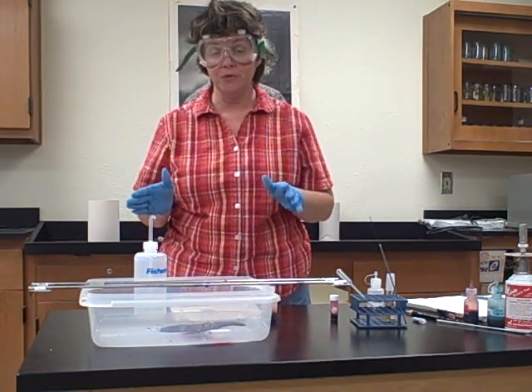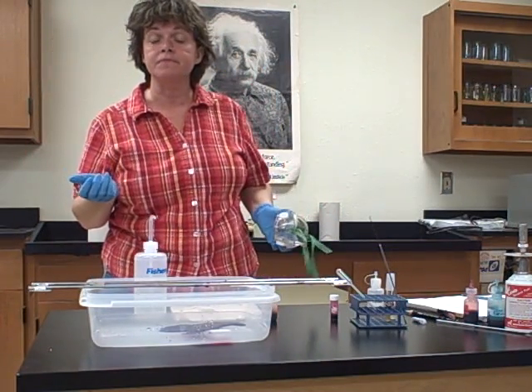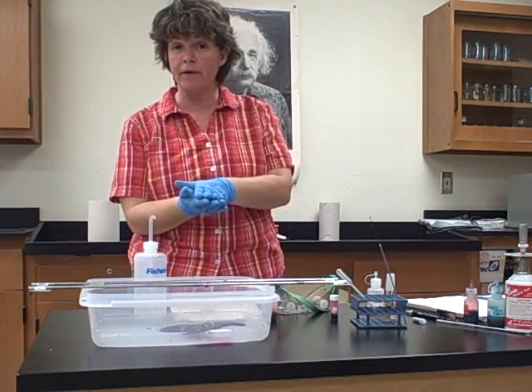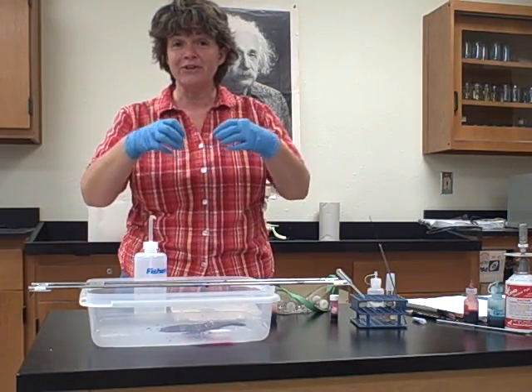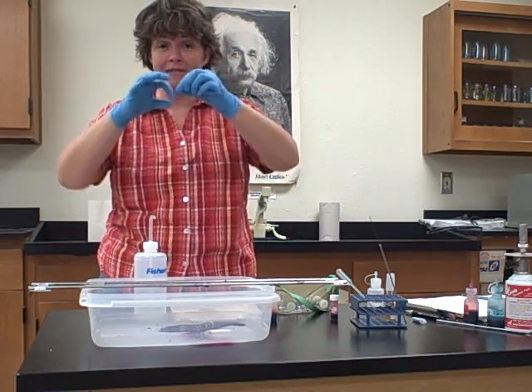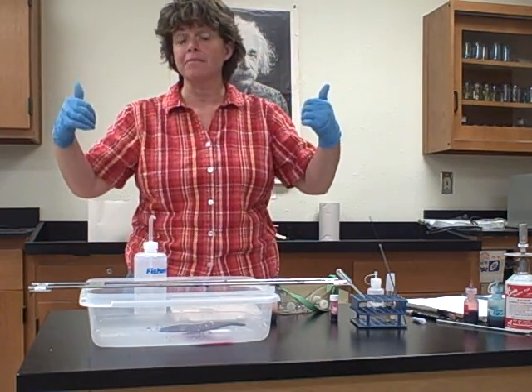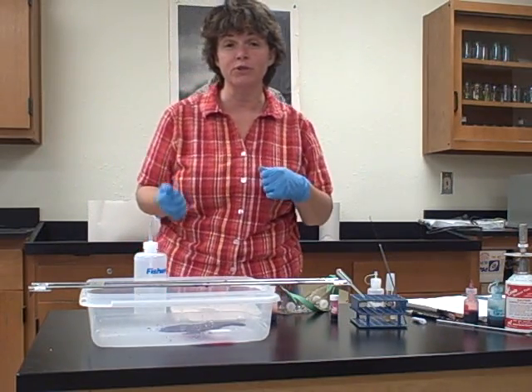Okay. One of the cool things about this particular stain is that it's a negative stain, so it stains the background, and the bacteria are not stained, and they look like clear halos. They look like ghostly bacteria. The streptococcus, because it's in chains, actually looks like a string of pearls inside that dark background, and the background's usually a grayish or pinkish color. So it's a really, really cool stain to see.